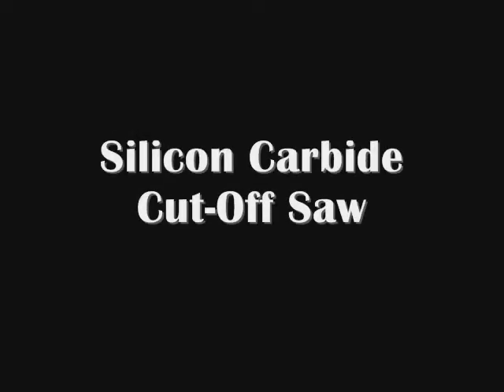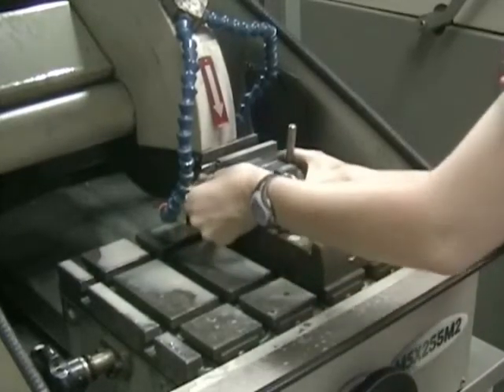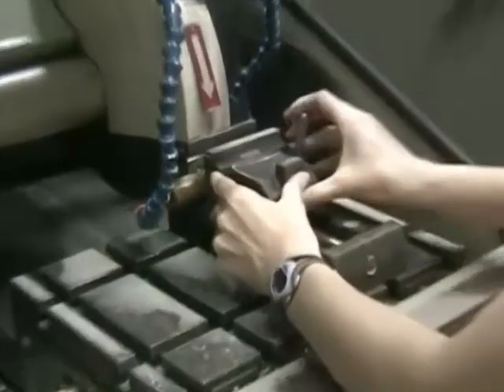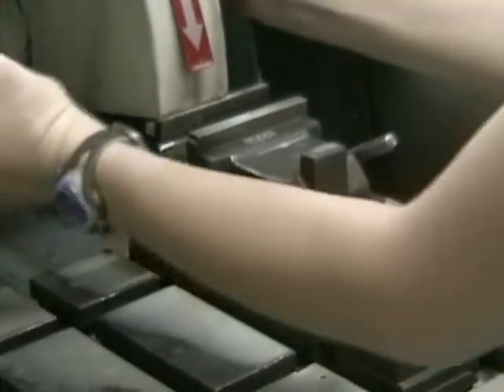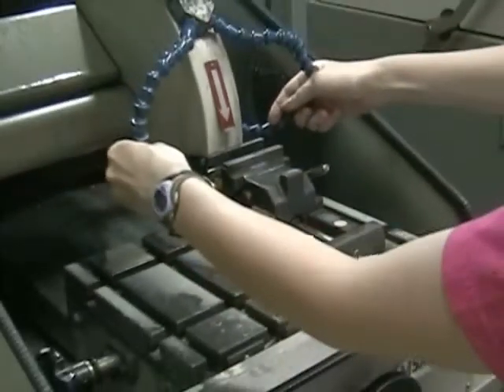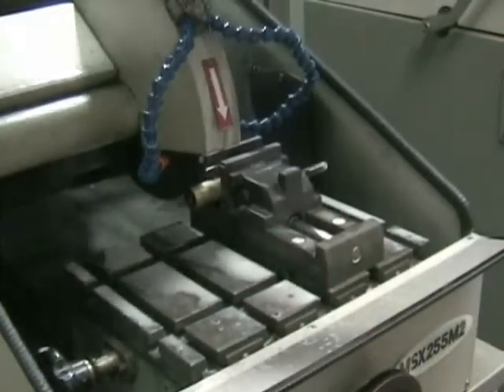The silicon carbide cutoff saw has a thicker blade and can be used for larger samples. This sample is an aluminum bronze ingot. Make sure when you put the sample on the saw that it's completely tightened down, otherwise it will wiggle itself loose and end up breaking the saw blade.